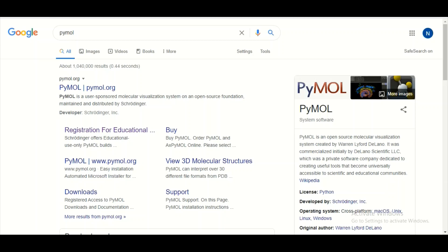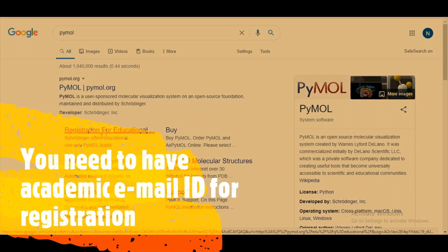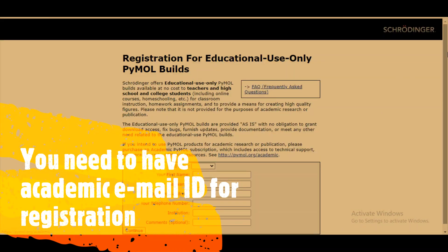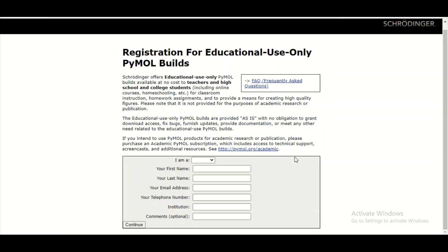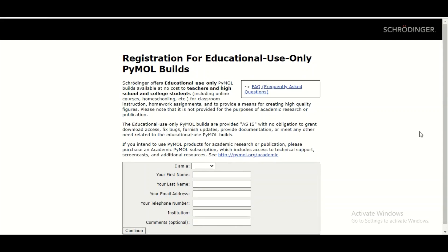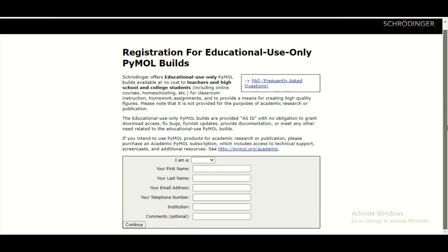To download PyMOL for educational purposes, you need to click on this link. When you click on this link you will be taken to a registration page, where you have to register yourself with your academic ID. Academic email IDs are those which end with .edu. If you have an academic ID, you can register here and then you will receive an email link through which you can download PyMOL for educational purposes only.